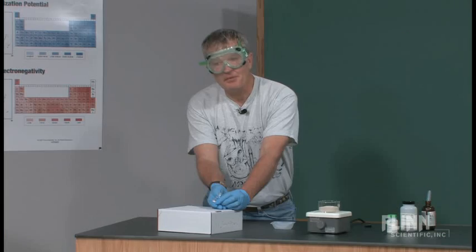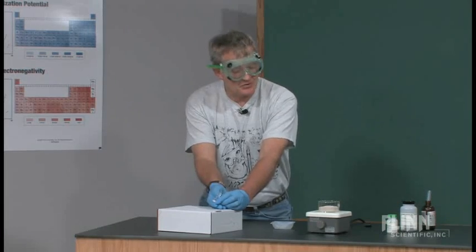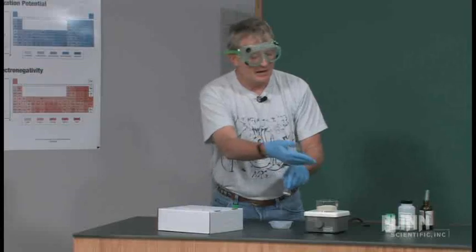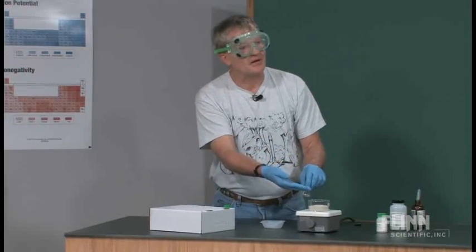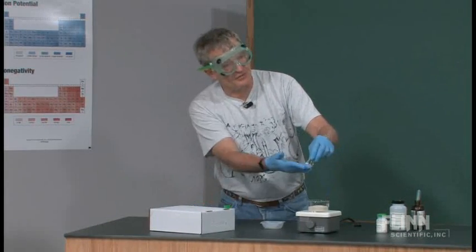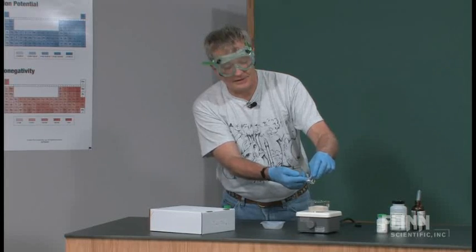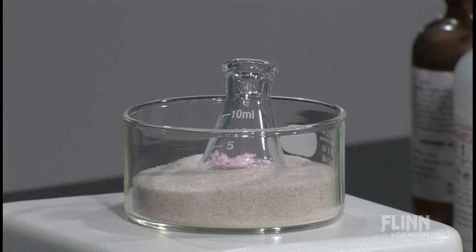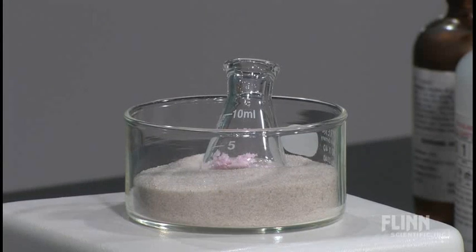But if they calculate the formula for the compound using the information they have, the mass of the manganese that they started with, an excess of hydrochloric acid so that now they can do a subtraction from the product to find out the chloride or the chlorine that's in there, they'll get an empirical formula that comes out to be real close to MnCl2, which is what it's supposed to be.